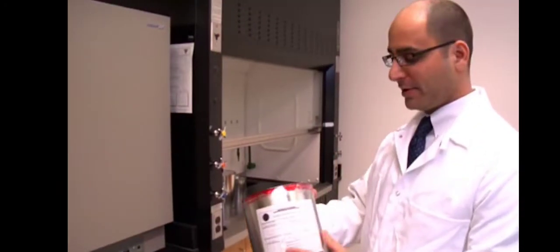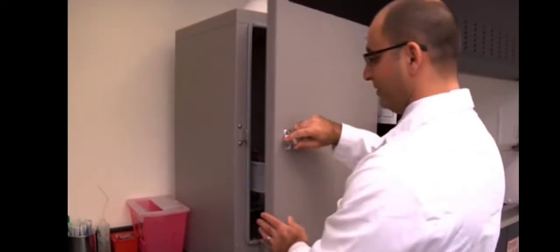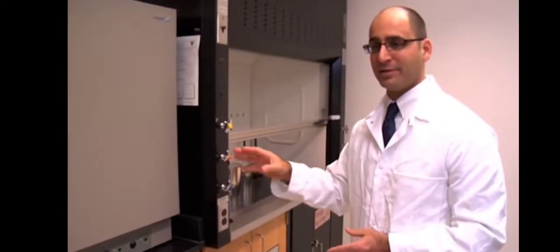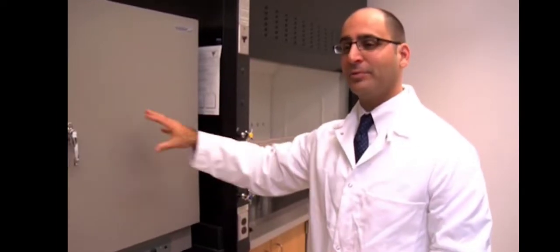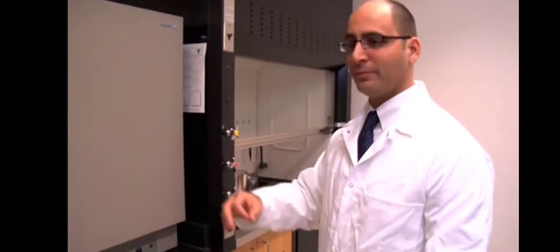So after we've prepared our can, we then take it over to the oven, place it in the oven for a predetermined period of time, depending on what type of analysis we're going to perform and what kind of information we need to get from the sample. If we're doing heated headspace, typically we'd place it in there from anywhere from 15 minutes to about a half hour, depending upon the size of the can and what's in the can. After that period of time, we would then take the can out of the oven while it's still hot, draw off some of that headspace vapor, and inject it into our instrument.